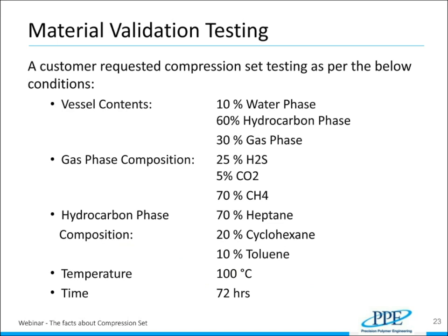And the final point that I'd like to touch on would be the fact that the vast majority of compression set testing is carried out in air. Now, clearly, most applications are not in pure air; they're in various other things. So a customer of ours requested that we carry out compression set testing not in air, but in what was believed to be a fairly aggressive sour gas environment.